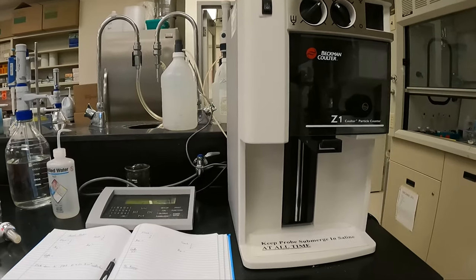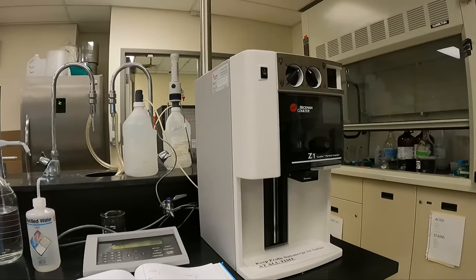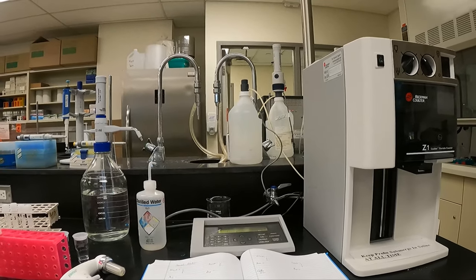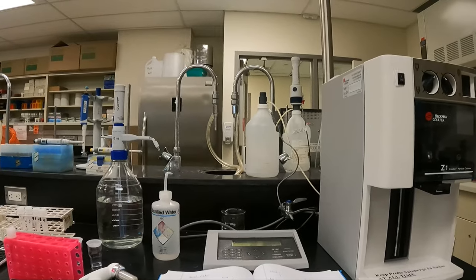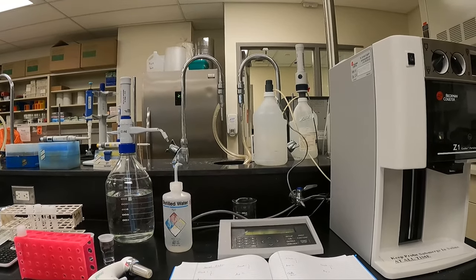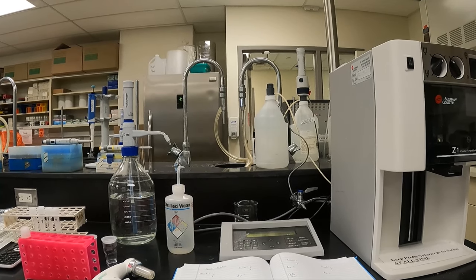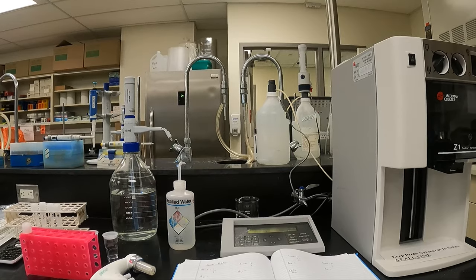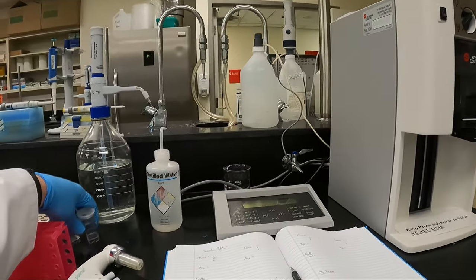In today's lab, we're going to perform a serial dilution down to a desired concentration and volume of cells. We've subcultured our BHK cells and saved the cells in the SnapCap test tube. In a lecture several weeks ago, I asked the students to call out three numbers. The three numbers they called out were 4, 5, 6. So I'll be diluting these cells down to 4.56 times 10 to the 3 cells per mil.